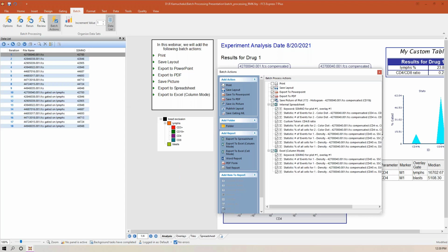So my last step now is to confirm I'm on iteration 1. So yep, if I click away, you will see this nice blue band for the first data file that is being displayed on your layout. I do want to start with this data file. I'm only going to do those first 9 iterations. And so now the next thing I need to do is just click on run. So I'll click run here.